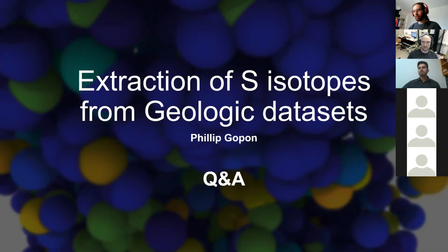Great. There's a question from Dan. I think this is with his software development hat on. What do you think the main areas for software development are for people working on geological specimens? I mean, for us, the big thing is being able to look at chemistry very carefully, and isotopes are something that geologists are very interested in, looking at isotopes on the nanoscale.